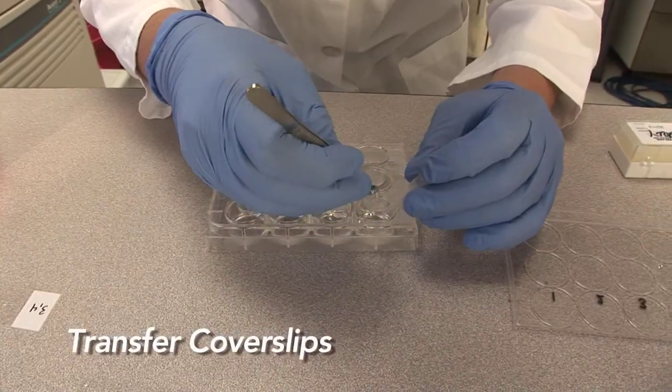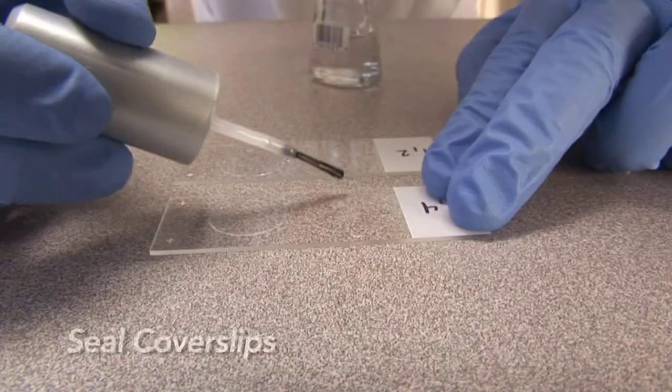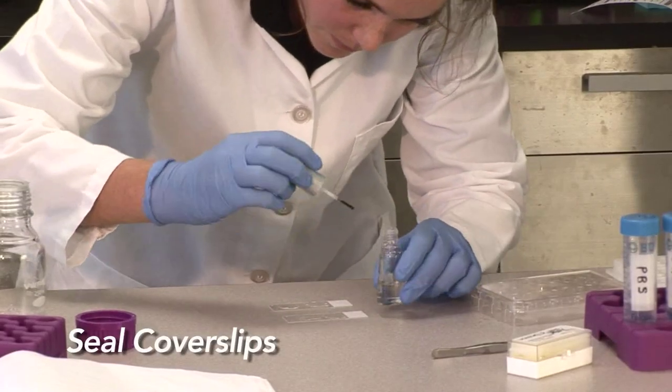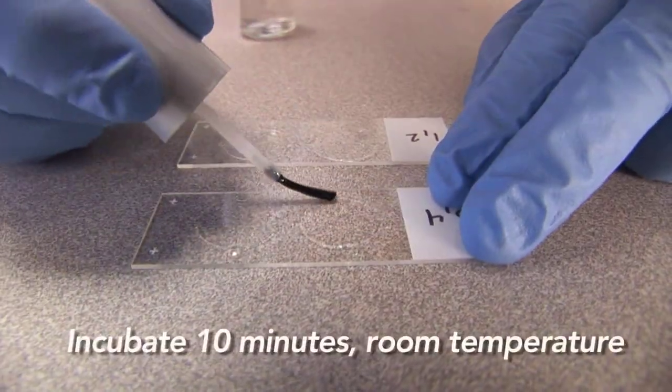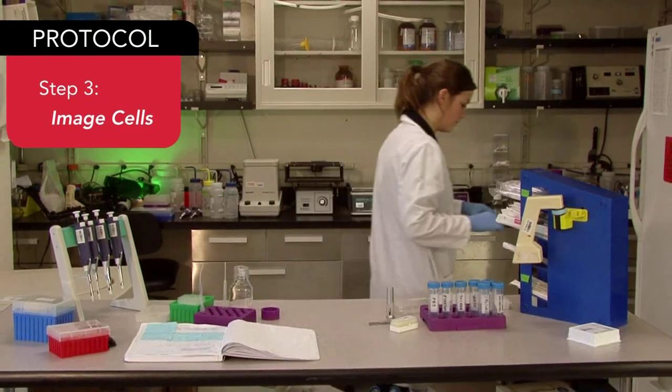The cover slips are then transferred face down onto the single drop of anti-fade buffer plus enzymes. Carefully seal the cover slip with clear nail polish. Incubate your cover slips for at least 10 minutes at room temperature until the nail polish has dried, and proceed to imaging. So now, the last thing to do is to image your cells on a normal wide-field fluorescence microscope.